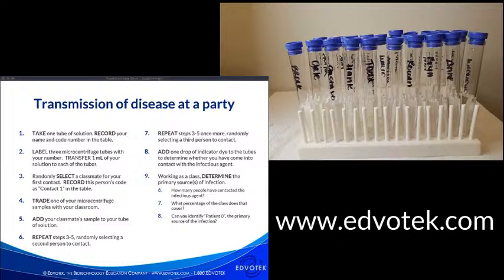And so I basically performed all of these steps already because I could imagine that sitting here and watching me pipette liquids into tubes would be incredibly boring. But I just want to run through what I did in terms of the protocol, and then we'll start analyzing the results.